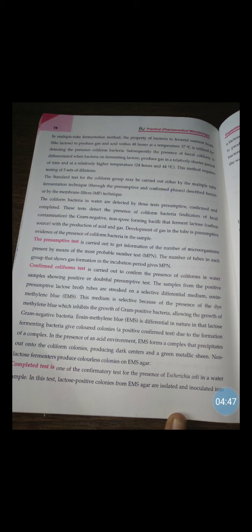The standard test for the coliform group may be carried out either by the multiple tube fermentation technique, through the presumptive and the confirmed phase, or by the membrane filtration technique, that is MF.